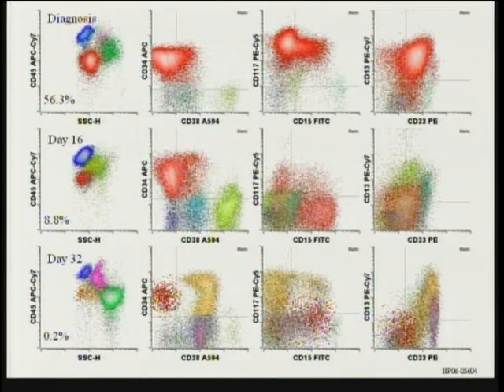Similarly, in acute myeloid leukemia, here we have a patient that's been treated. At diagnosis, the immunophenotype is typical of AML in that we have a large expanded progenitor population on CD45 side scatter. This population is immature, as evidenced by the expression of the immature antigen CD34, and has aberrant low to absent expression of CD38, overexpression of c-KIT or CD117 with a little bit of myeloid maturation antigen CD15, and uniform expression of the two myeloid-associated antigens CD13 and CD33.